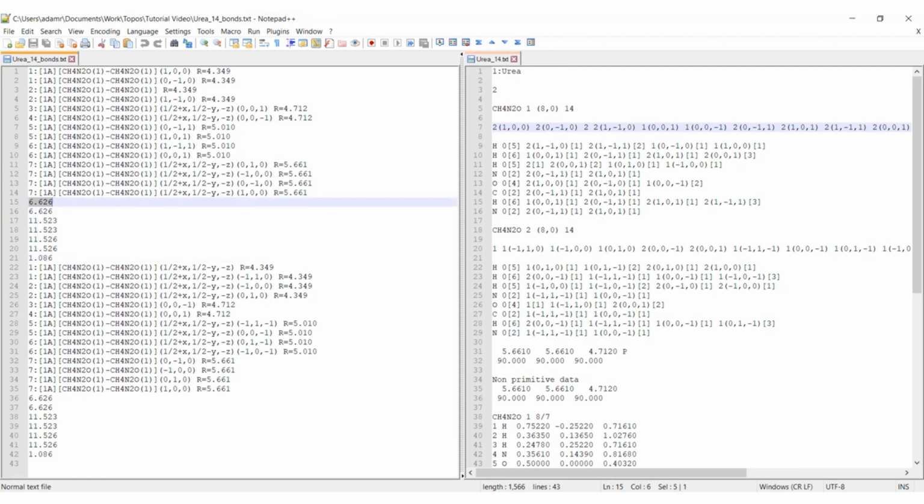So what's going to happen when you're running simulations in Crystal Grower is you're going to be changing these values. You're going to look at these interactions and make some educated guesses based off of solvent coordination. Is it a hydrogen bonding solvent? Is it a polar solvent? And that can help you make some judgments on what energies should be largest.